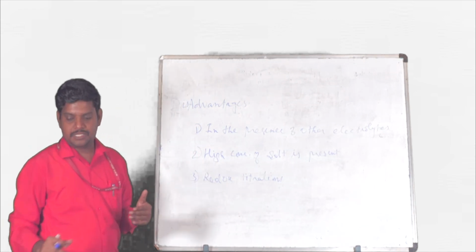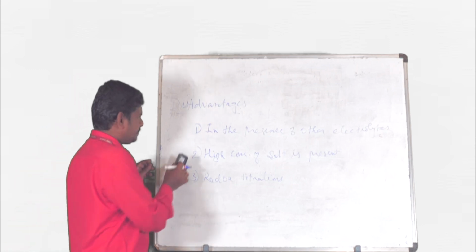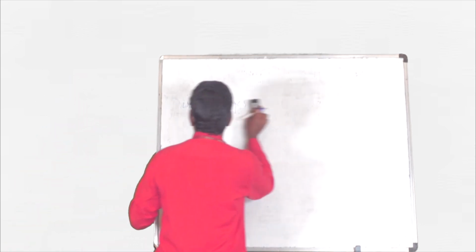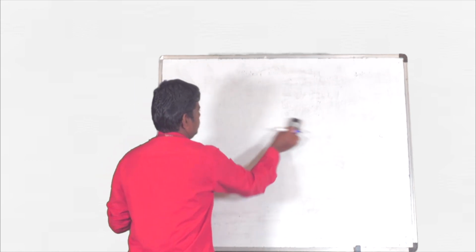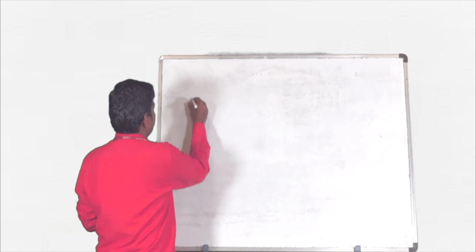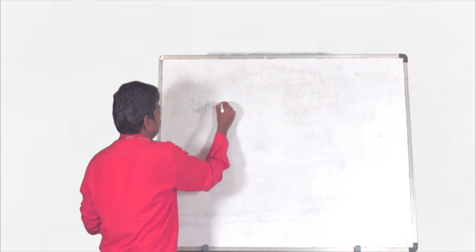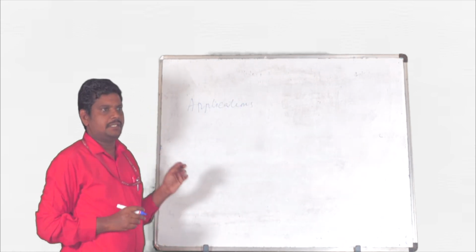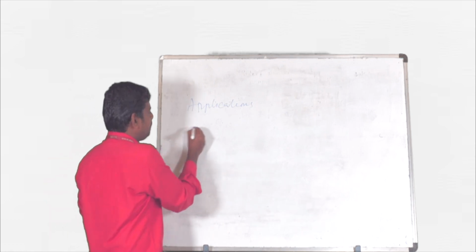The applications of conductometric titrations: mostly it is used for environmental monitoring.